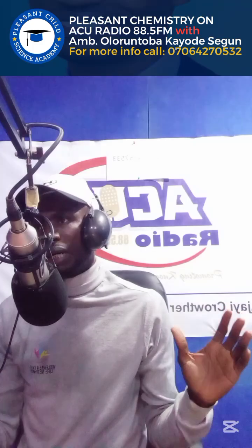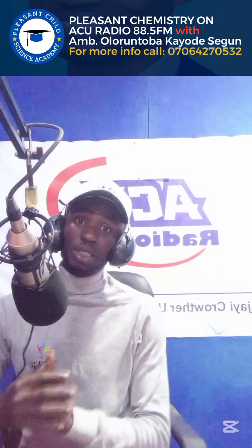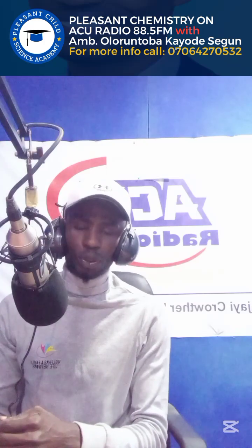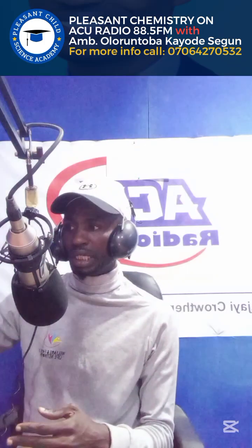Firstly, let's discuss how to get your readings. Please, my dear lovely students, make sure you draw your table very well. When you are drawing your table, you have your final burette reading first, then followed by initial, followed by volume of acid used. That's how you arrange them in rows.